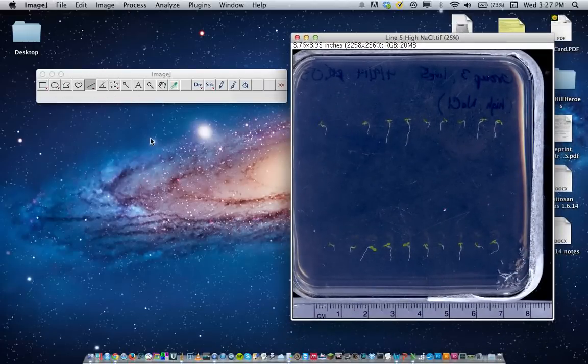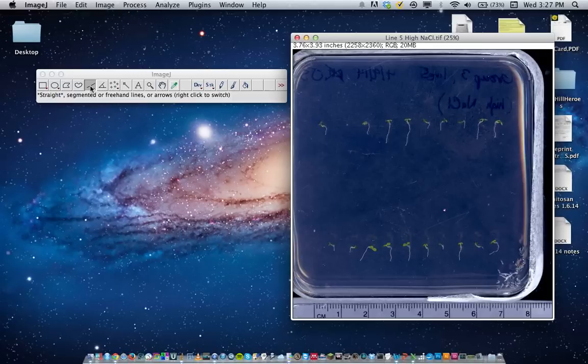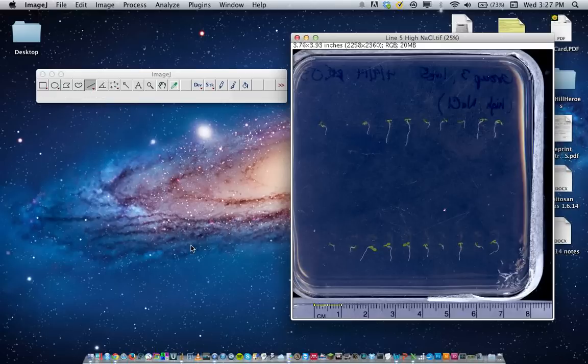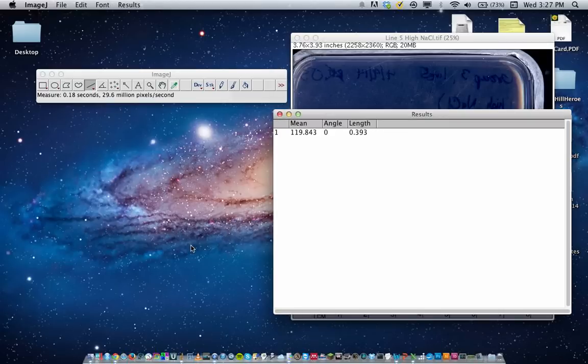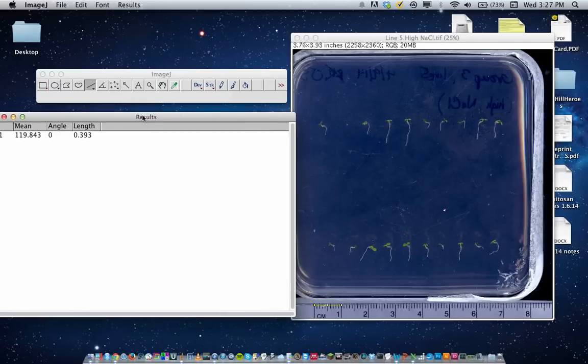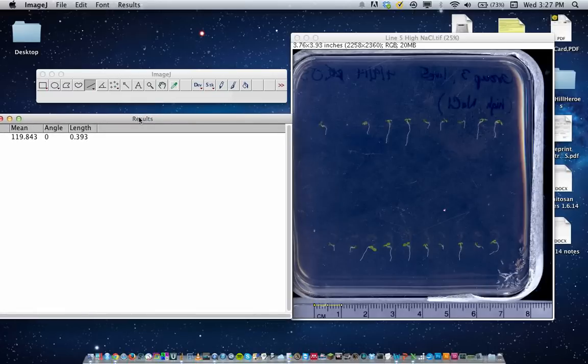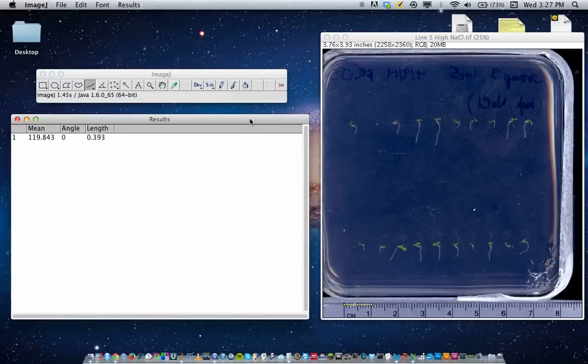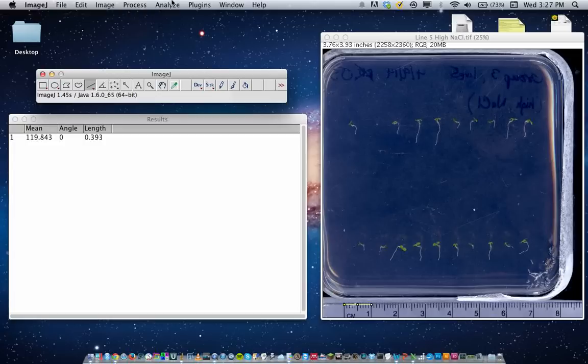What you want to do first is use this straight line tool. We can measure the distance of a centimeter in pixels. So that's approximately one centimeter. And if I hit Command M, or I guess Control M on PC, this results window will pop up and it gives us a length measurement.